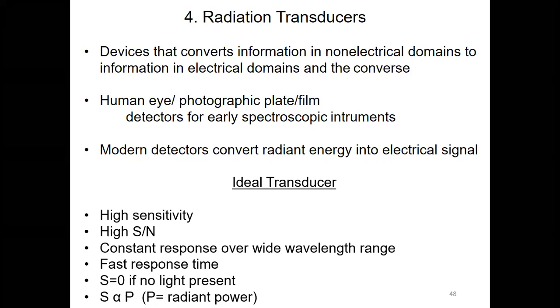If it is highly sensitive, then the transducer can detect the radiation, and we will get a good signal. Also the signal to noise ratio should be higher, which means the noise part should be less. Signal should be high. And it should give a constant response over a wide wavelength range.